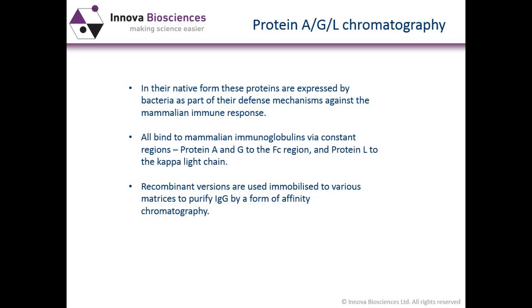I'd like to move on now to the protein A or G and L chromatography. Now, I'm sure the great majority of you will be familiar, certainly with protein A and protein G chromatography. These are probably one of the most commonly used forms of antibody purification that is now being used.